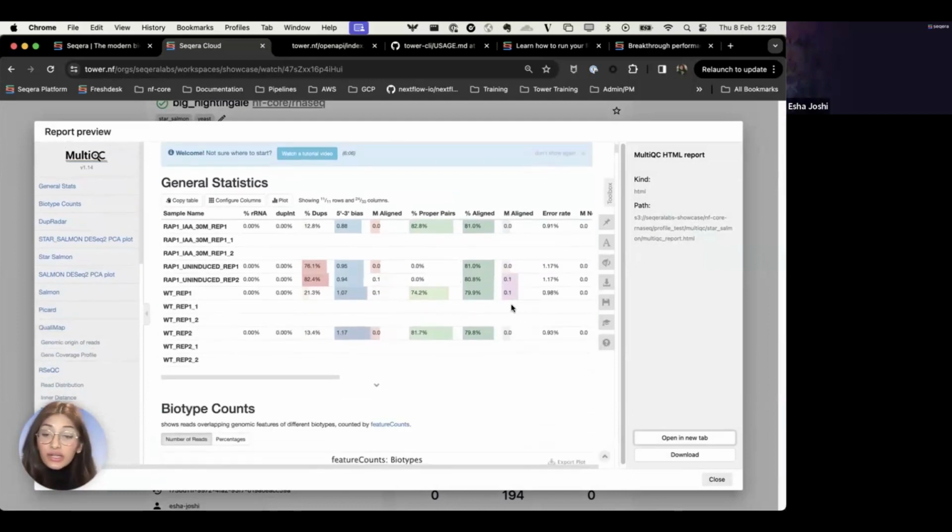And you can imagine a scenario where maybe you have some colleagues that are interested in seeing how a demultiplexing run went, or they just want to get a sense of whether your reads were aligned correctly. Instead of having to set up access for them through storage and infrastructure, we can actually view these results directly within the platform itself. And you'll notice that the path is still pointing to a location in cloud storage, but the platform makes it much more transparent and easily accessible to view results that exist in the cloud within the platform itself. We can additionally download them from the UI too.